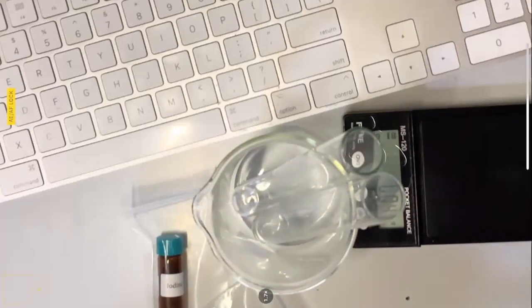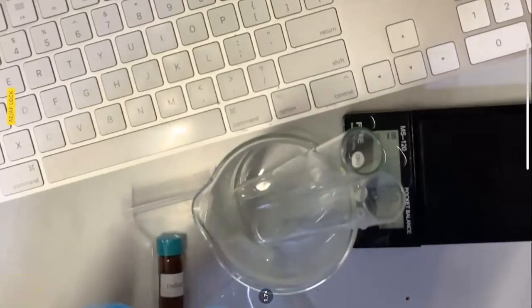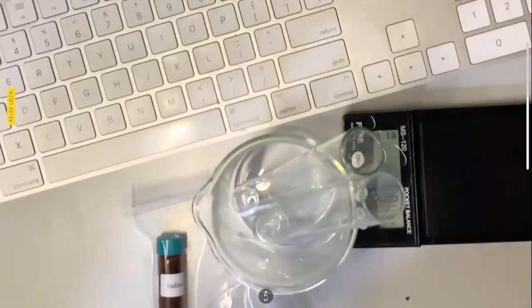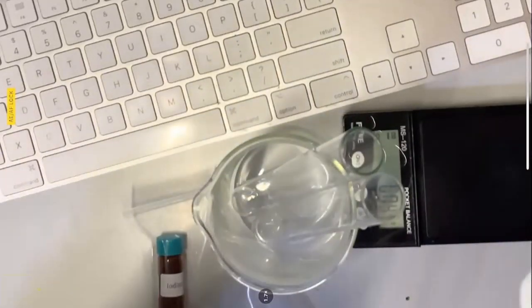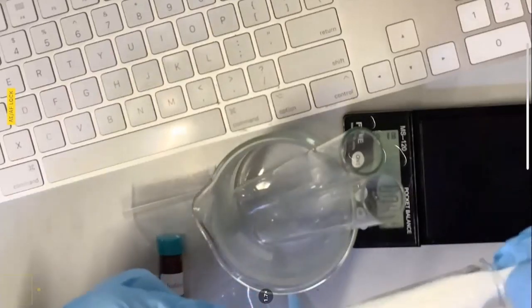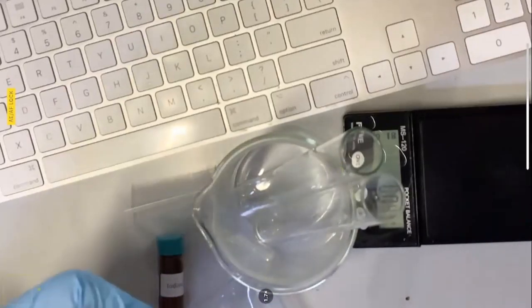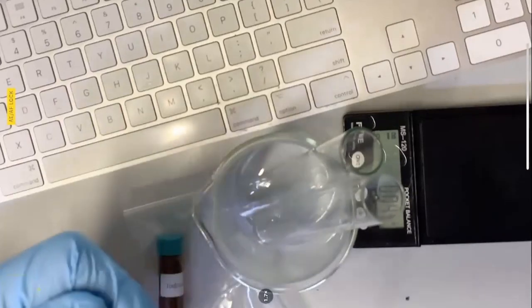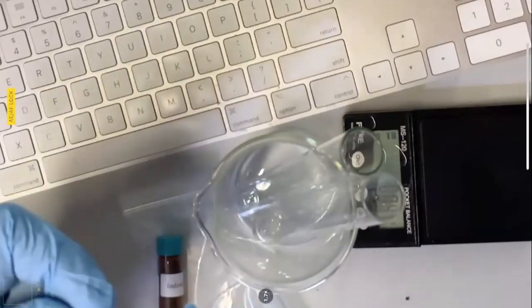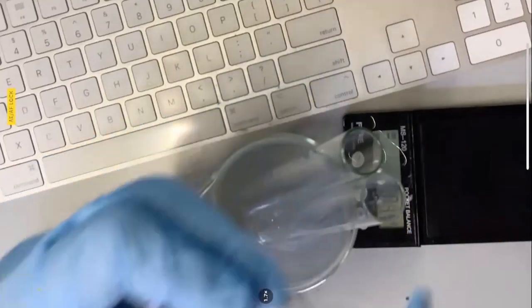Okay. And the way you dry it is you just take a piece of tissue or dry towel and just push it in, and then use your glass stirring rod so it goes all the way to the bottom. Make sure that you have a way to pull that thing out. Otherwise, it's going to get stuck in there and then you won't be able to use your graduated cylinder because it's going to be very difficult to remove that piece of paper towel. Anyway, you've got to clean it out and it's got to be dry like that.